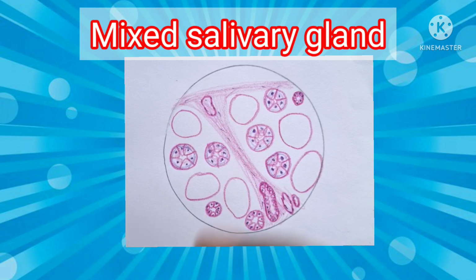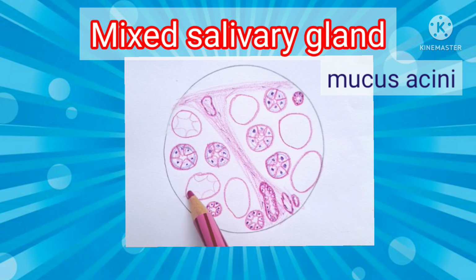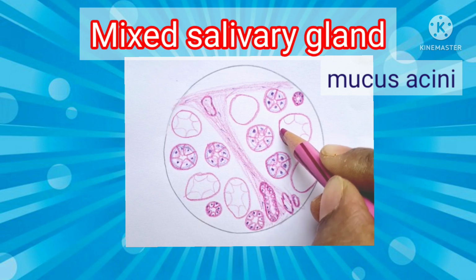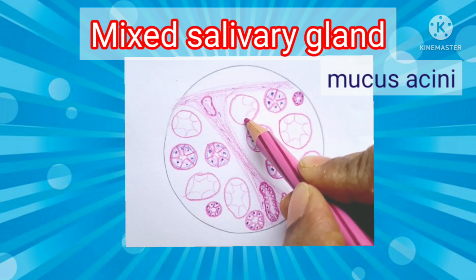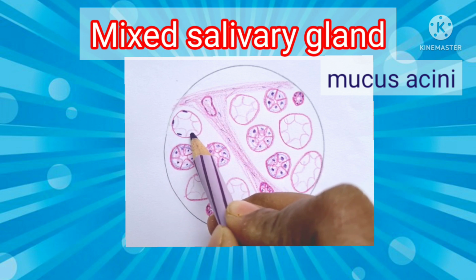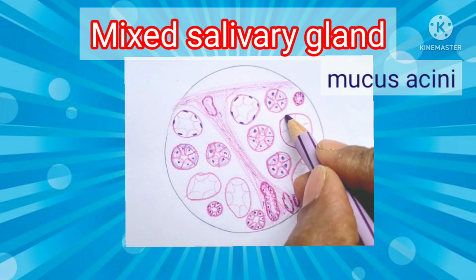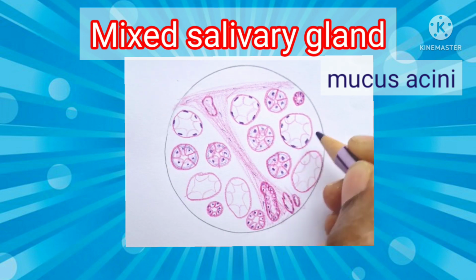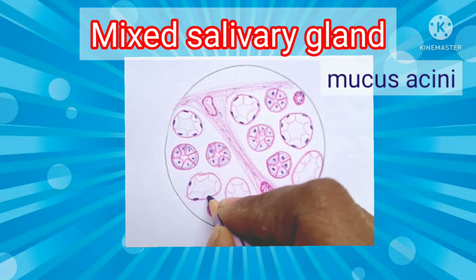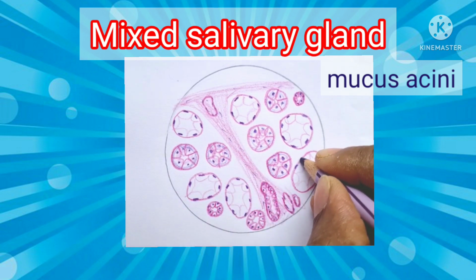Now after the serous acini, you can write some mucous acini with cylindrical cells and the flat nucleus. Serous demilunes: demi means half, lune means moon. So half moon shaped serous cells are present over the mucous acini. That's why they are called serous demilunes. Okay, half moon shaped serous cells. So in one or two mucous acini, make a cap of serous cells that shows the serous demilunes.